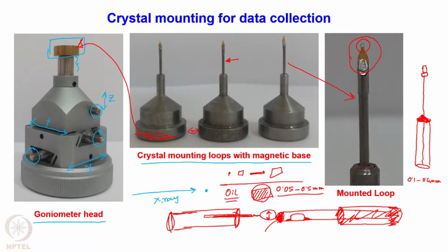So by doing these different types of mounting, one can then do the data collection on any diffractometer.